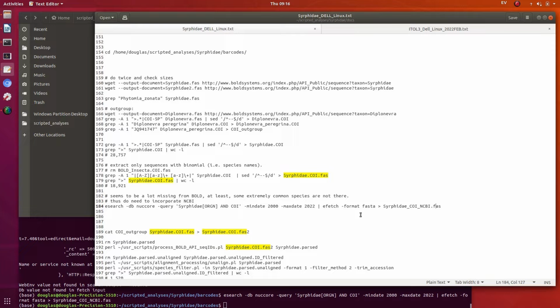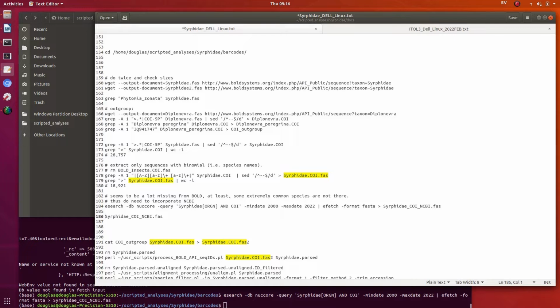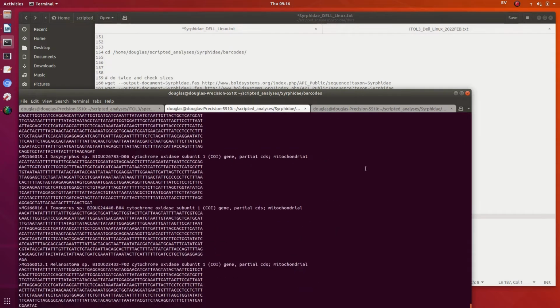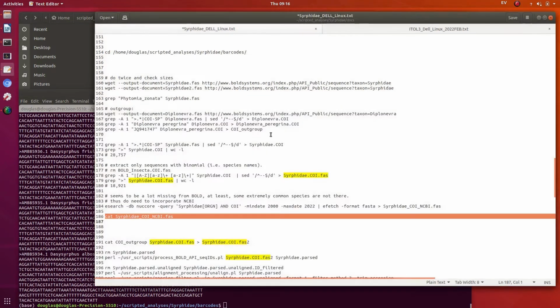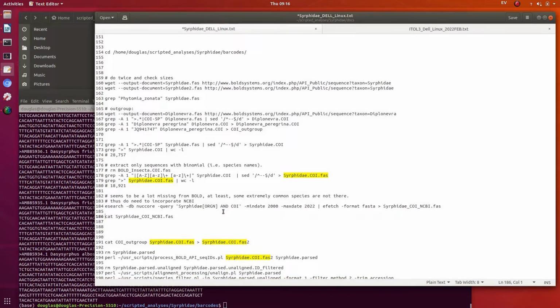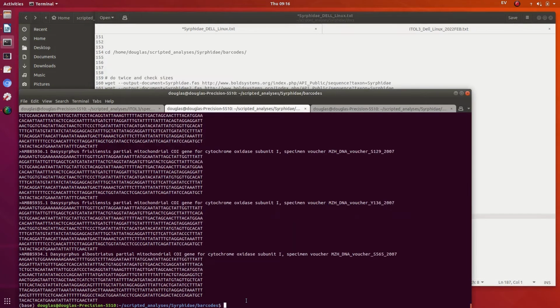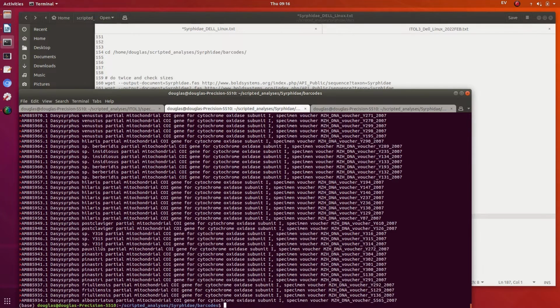So first, let's take a look at the file. We can use cat just to print the output to the screen, and this gives the full FASTA output. And we use grep to print only the ID lines, whose FASTA delimiter is the forward arrow. So we do a string search and we're just printing the ID lines.